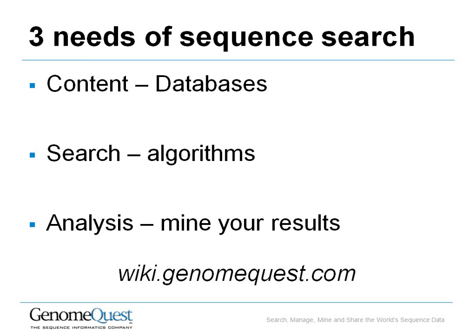And finally, analysis. Results come back usually in hundreds or in thousands and you need to be able to mine them. GenomeQuest provides powerful filtering, grouping, and sorting facilities to give you a complete idea of what your results are saying.